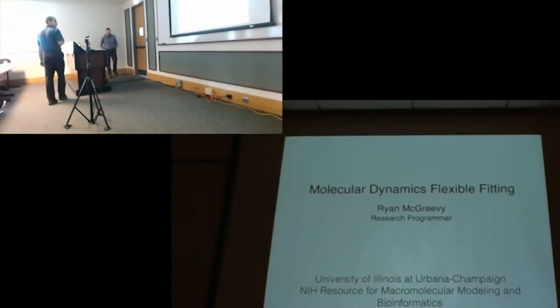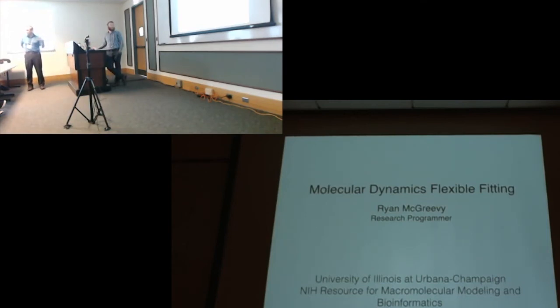Okay. Ryan is one of the developers of Center. He has been working on molecular dynamics flexible fitting for several years. And again, if you have collaborations with cryo-EM people or you are doing experiments, maybe some of you, this is a very useful method. And that's a very good example of the methodology that is of great use to what is happening in experimental structural biology.